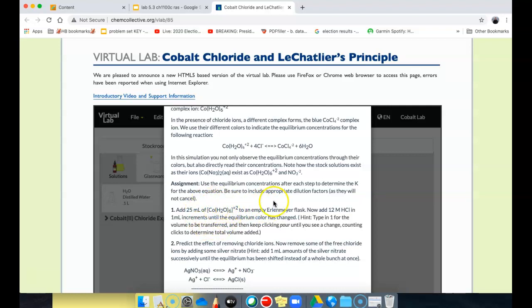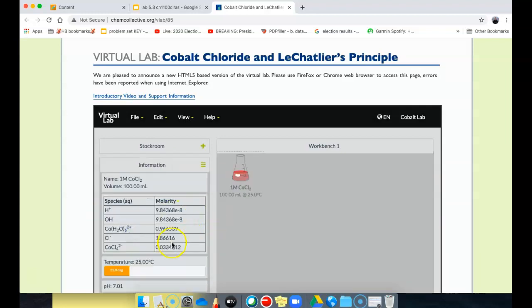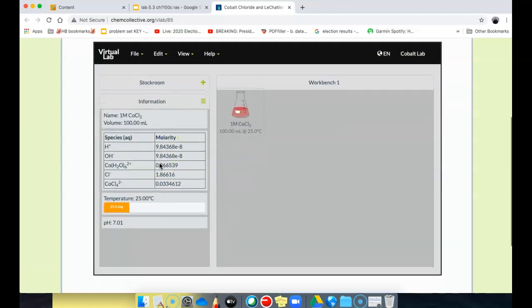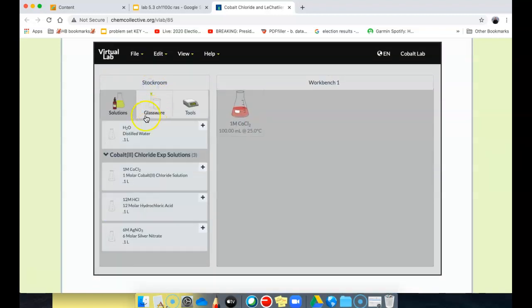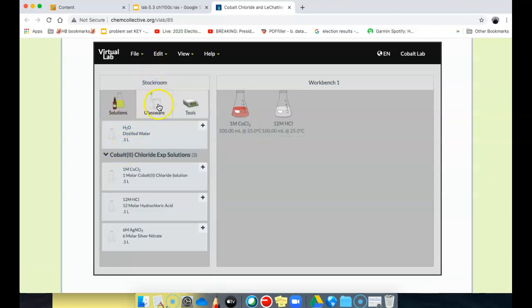So what they're really saying is just grab some of that cobalt chloride and add 12 molar HCl in 1 ml increments until the color changes. Let's go ahead and do that. So let's put the cobalt chloride solution out there. Oh, I noticed we also have the 12 molar. I'll need some of that. And let's grab an Erlenmeyer flask as well.